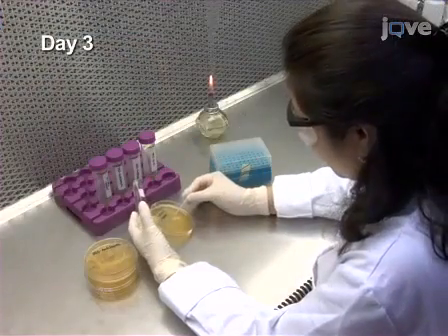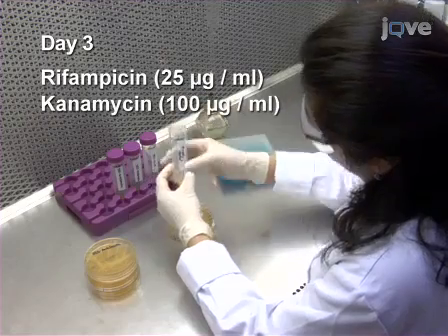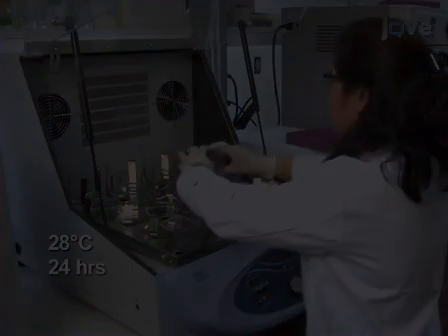On the third day, inoculate 2 milliliters of selective LB with a single colony from each plate. Incubate each culture by shaking at 28 degrees Celsius for 24 hours.